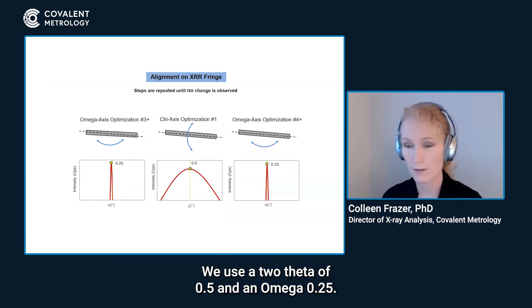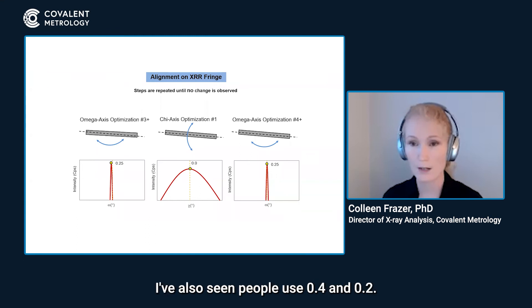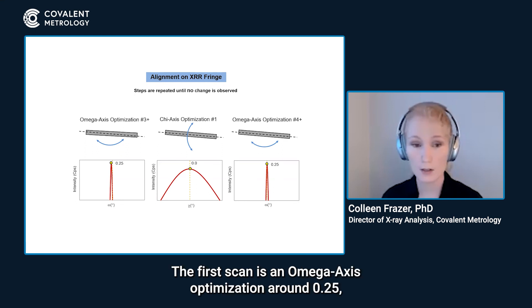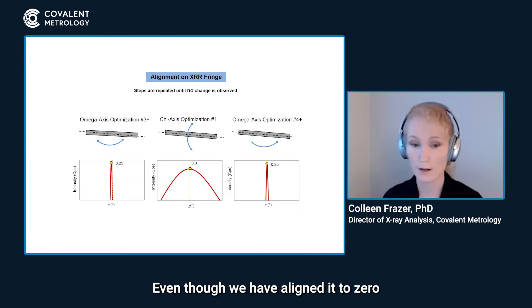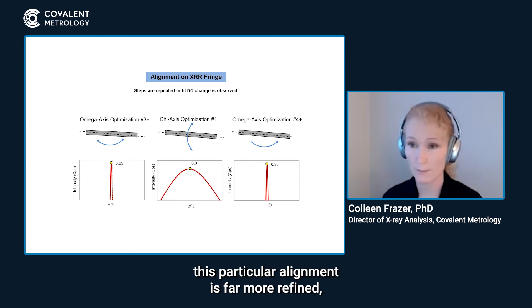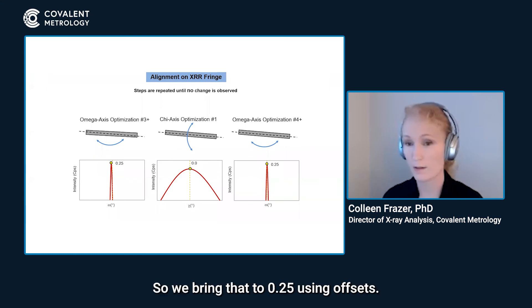We use a two theta of 0.5 and an omega of 0.25. I've also seen people use 0.4 and 0.2. Anything in that range is fine. It doesn't have to be a very specific number. The first scan is an omega axis optimization around 0.25 and you can see that our peak is not exactly at 0.25. Even though we have aligned it to zero in the previous steps, this particular alignment is far more refined, far more sensitive. So it's not unusual for that first omega axis optimization at the fringe to actually be a little bit off. So we bring that to 0.25 using offsets.